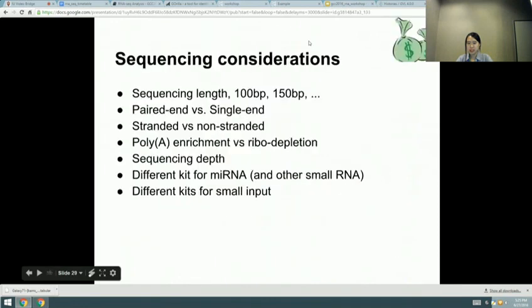It's just choosing how many sequence lengths and whether single-end or paired-end. Single-end is probably all right if you're doing A versus B comparisons. Poly A is probably all right if you're doing simple comparisons, rather than rRNA depletion. If you're using microRNAs or other types of RNAs, then for more complicated experiments, rRNA depletion is all right. But poly A is cheaper, I guess.